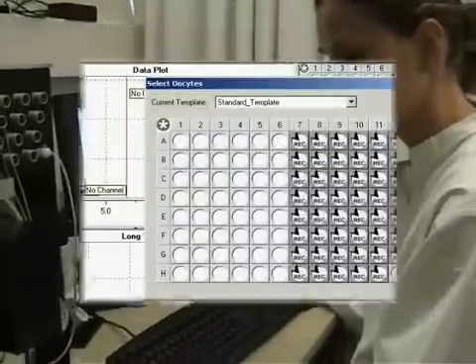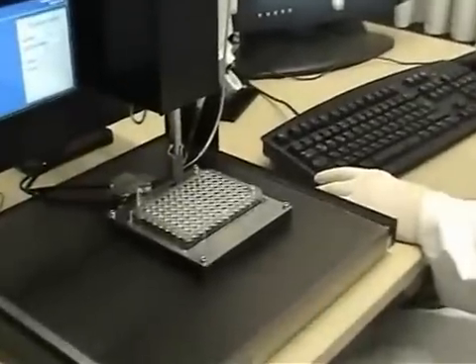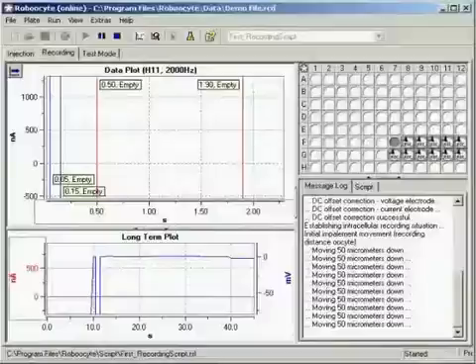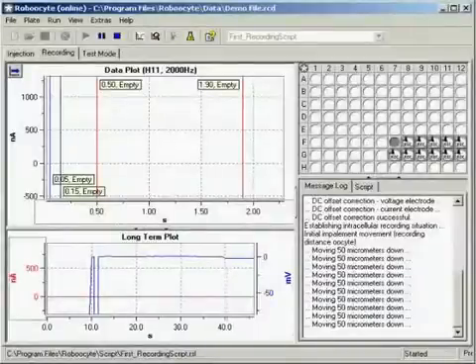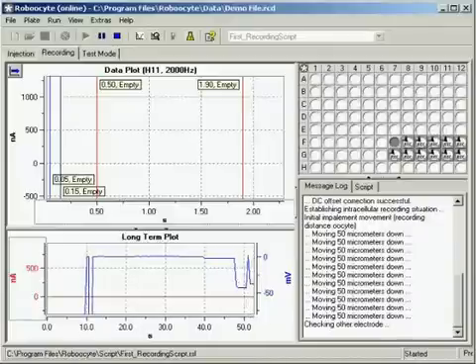The oocytes are selected for recording, and the recording protocol is loaded into the Roboocyte program. The electrodes are lowered stepwise. The membrane potential is monitored until a successful impalement can be confirmed for both electrodes.